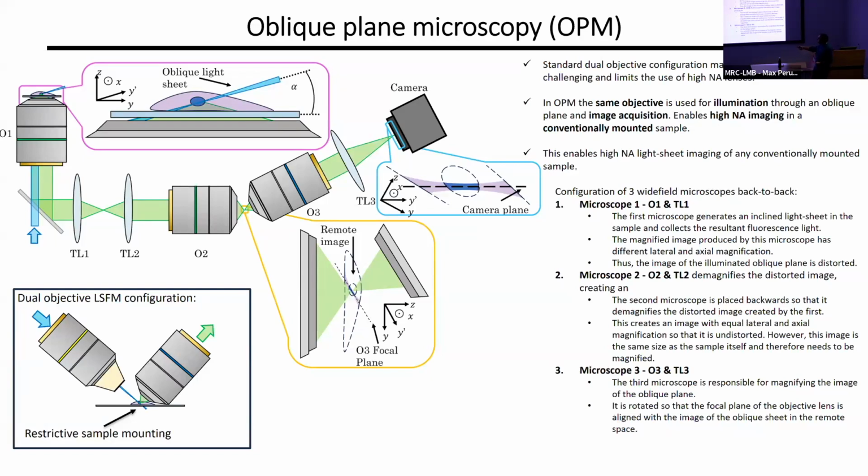So the advantage now is that you can place a third objective here, a third microscope, with a specific orientation that would counter the orientation of your cells, so the focal plane has the same orientation as the cells. So this one will image this one here, and then you end up with a correct image with the correct focal plane. And this was also built by James Manton with help from Jacob and from Akash, and you can talk to them also to use this microscope.